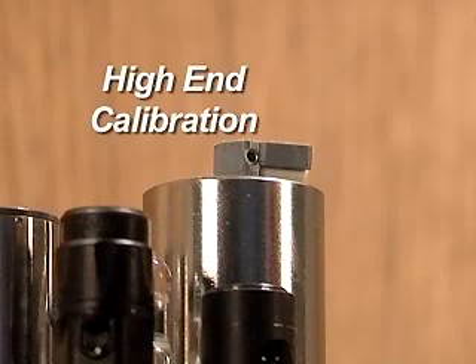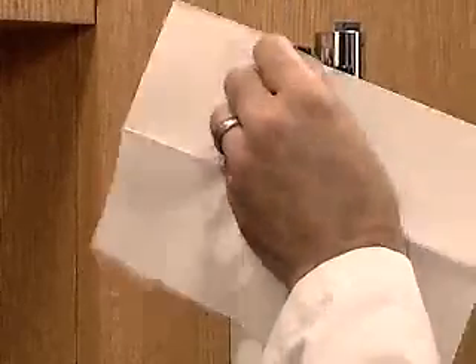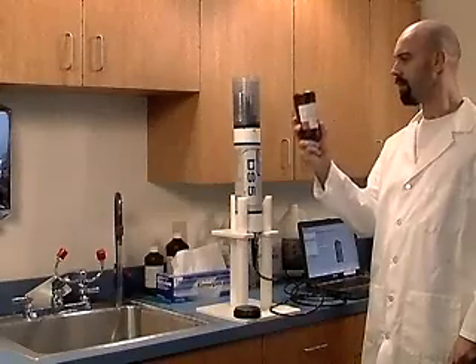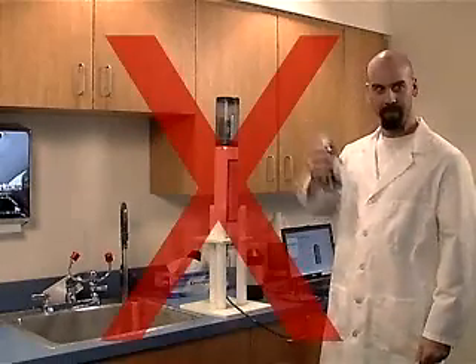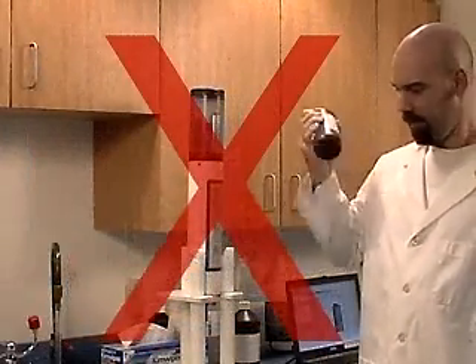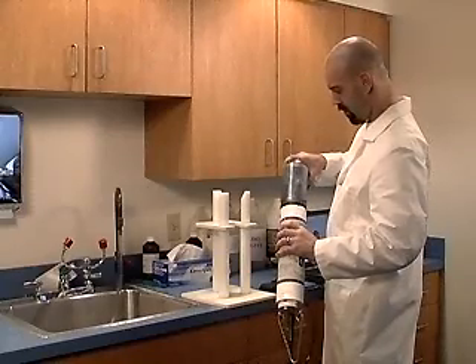High-end Calibration. The high-end calibration point should be a value higher than the highest value anticipated at the deployment site. The standard factory high point is 100 NTU. Pour the deionized water out of the storage cup and dry the sensors again. Gently swirl or invert the bottle of 100 NTU StableCal for two or three minutes to mix the suspension. Do not shake the bottle of StableCal, as this will suspend air bubbles in the solution and change the turbidity of the standard. Pour the StableCal into the storage cup until it is about 25% filled.